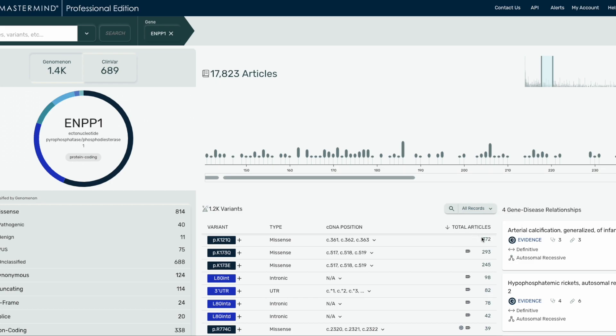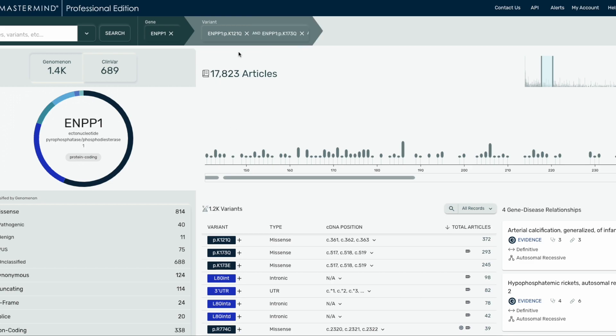Clicking the number of articles will link you out to the articles page where you can view the evidence, or you can add variants to your search by clicking the plus button. As you can see, as I click plus, all the variants I add are going up in the search bar. You'll be seeing lots of changes to Mastermind over the next year, and we want your help to build the best genomics intelligence platform. Keep an eye out for release notes for new features, and always feel free to reach out to our team for help with the application and any suggestions to improve Mastermind. Thanks.